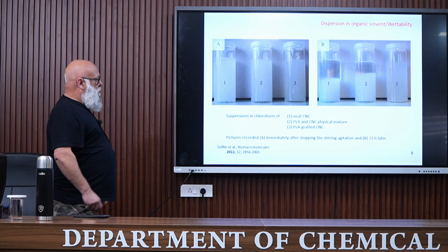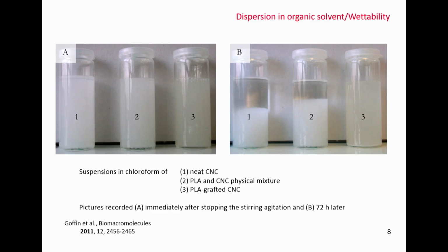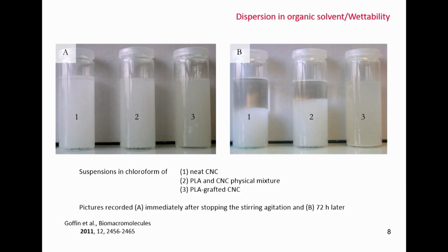This is another example, very similar also with cellulose nanocrystals. In this case, it's in chloroform because PLA was grafted on the surface of cellulose nanocrystals. And so it was also just after stopping the stirring agitation, and so longer time, 72 hours.